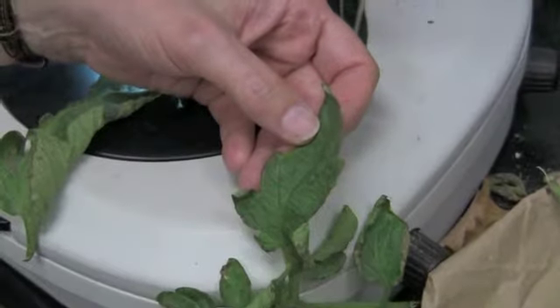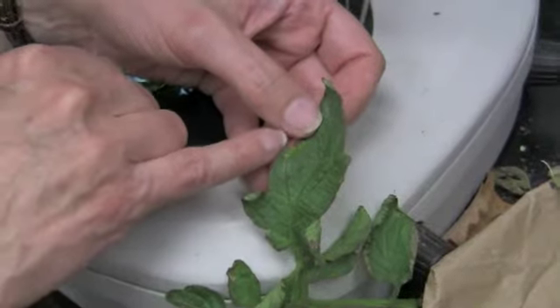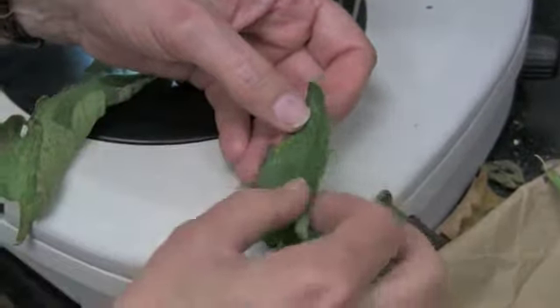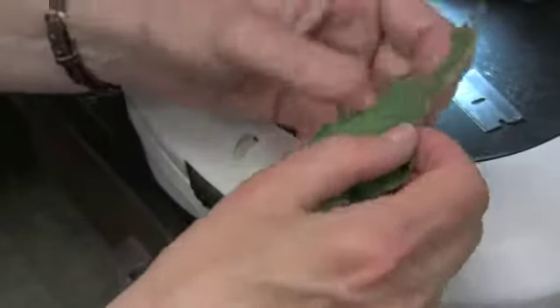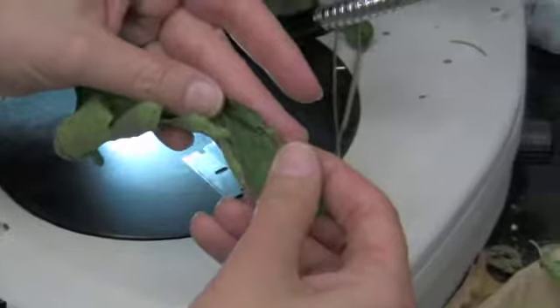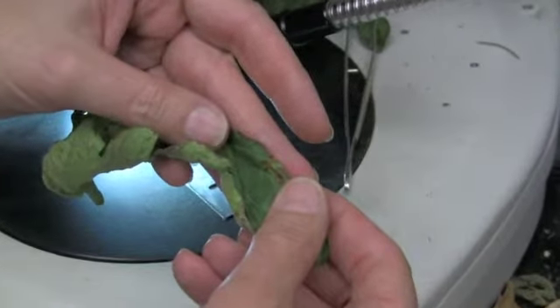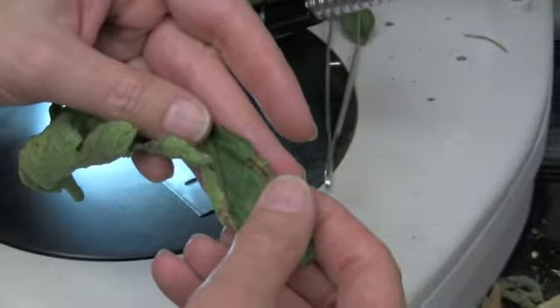In addition to looking at the small spots on this tomato leaf, I also noticed some lesions along the edge of the leaf. I once again took a small section of the edge of the leaf. You can see here where I've cut out a small piece where the lesion is, and have made a microscope slide, and once again we're looking for bacterial streaming.